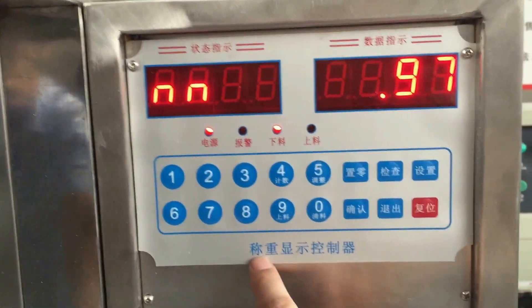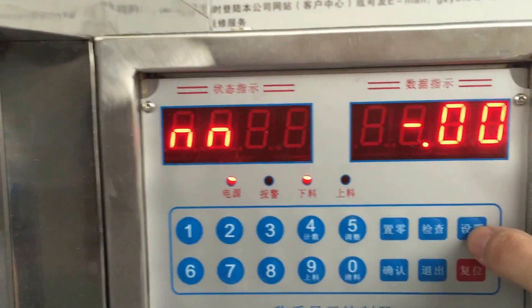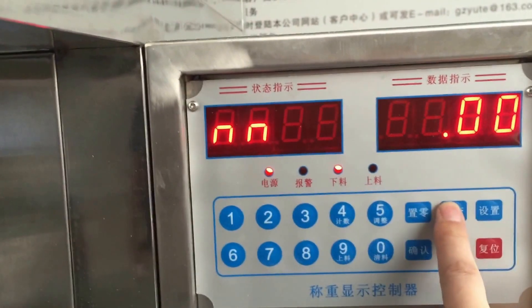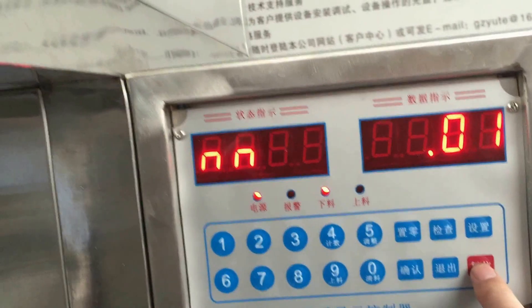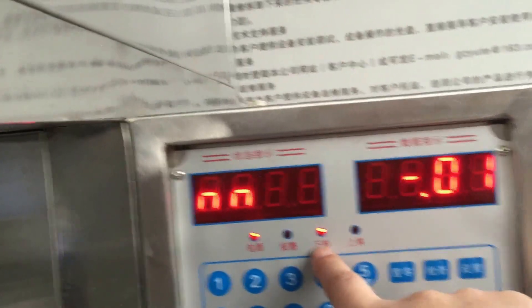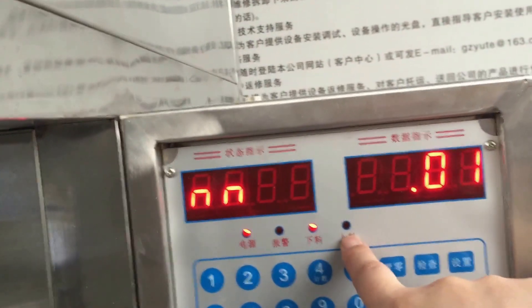This means the big display controller. Firstly, this means the setting up. This is the inspect, the zero, confirm, return to zero. This is the supplier alarm. Feeding volume, filling material, feeding material.